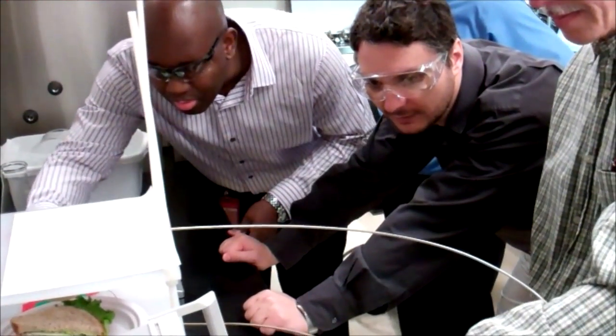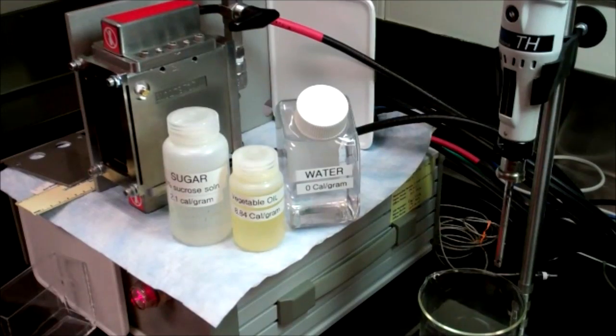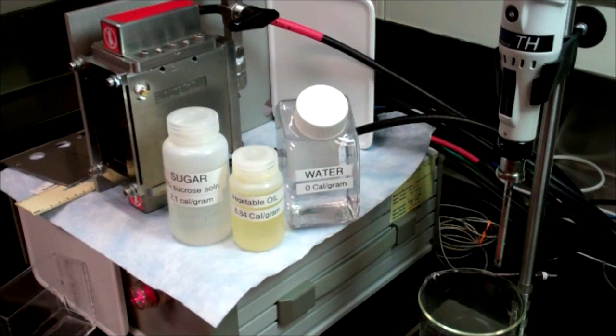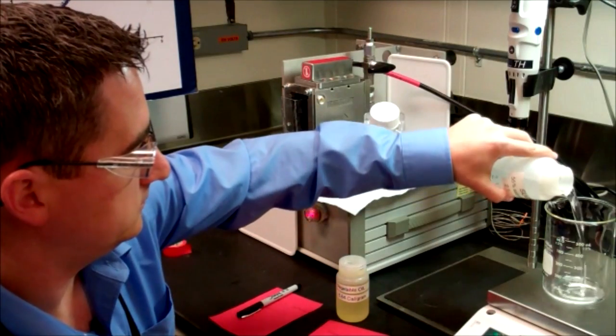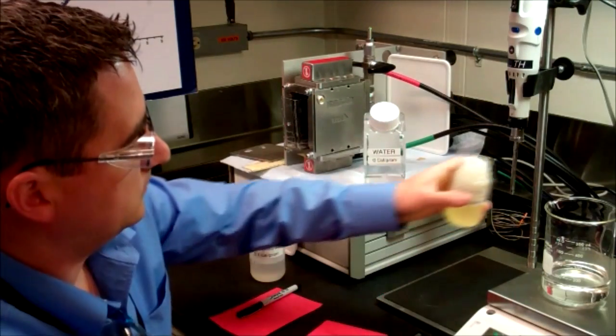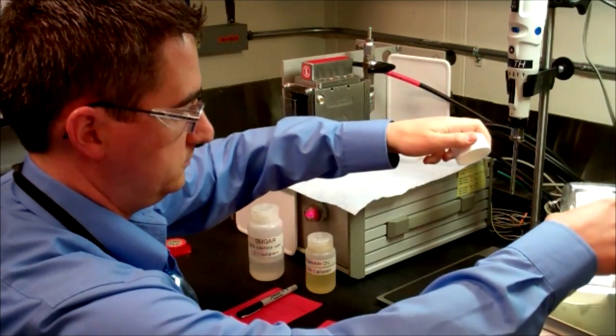It measures fat and water content to get to the total calorie count. The device assumes the rest of the food, whether it be protein, sugar, or carbs, has a predefined number of calories and lumps them all together. Biologist Matt Webster starts by weighing a sugar solution, vegetable oil, and water, then combines them to simulate an actual food item.